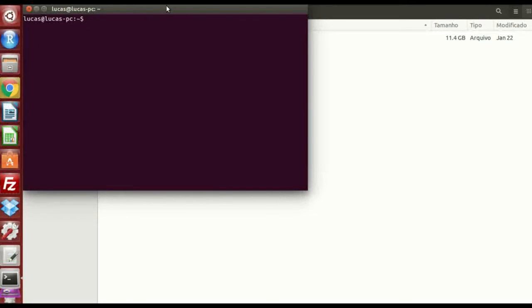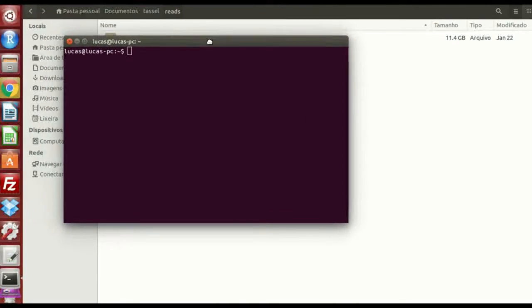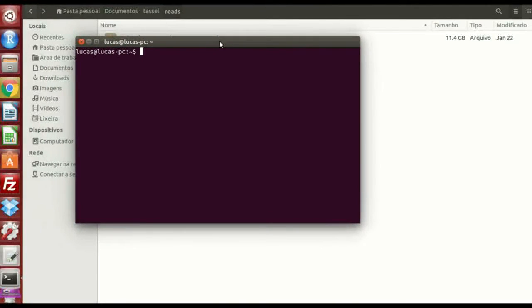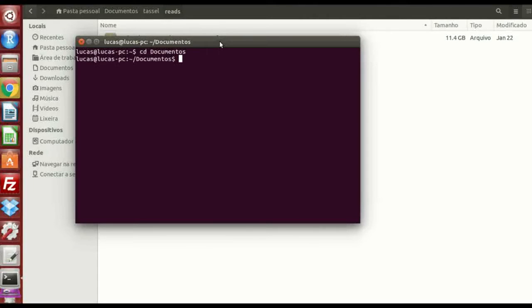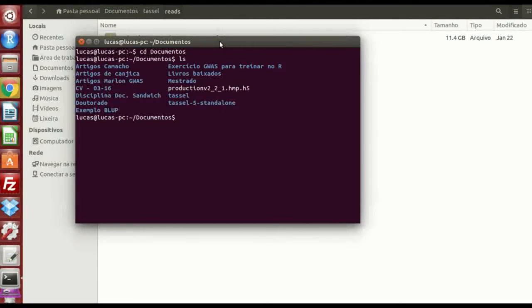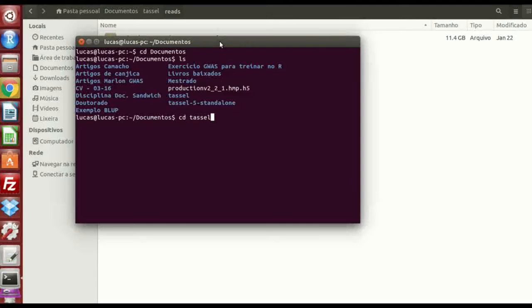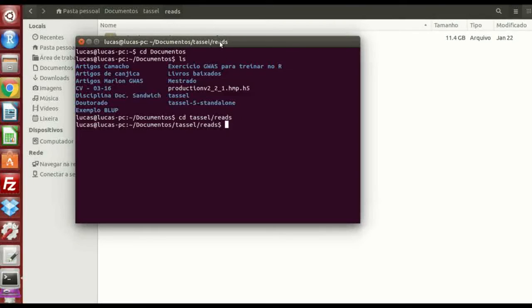I'm gonna open the terminal, and here I'm gonna change the directory to documents. These names are in Portuguese, because I'm from Brazil, so if you see something is different, it doesn't matter. What I have here inside this file, okay, cd tassel, reads.